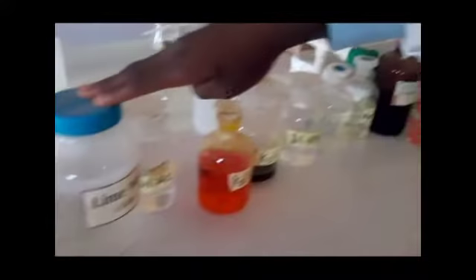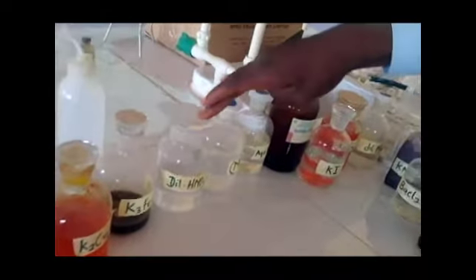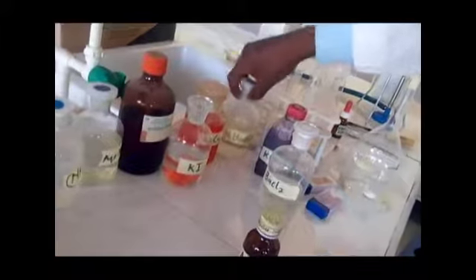Some of these characteristic reactions are evolution of gas, evolution or absorption of heat, formation of precipitate, production or disappearance of color. And some of these reagents are here in the text. We have potassium thiocyanate, lime water, dilute hydrochloric acid, dilute trioxonitric acid, silver nitrate, dilute sodium hydroxide, and so on and so forth.